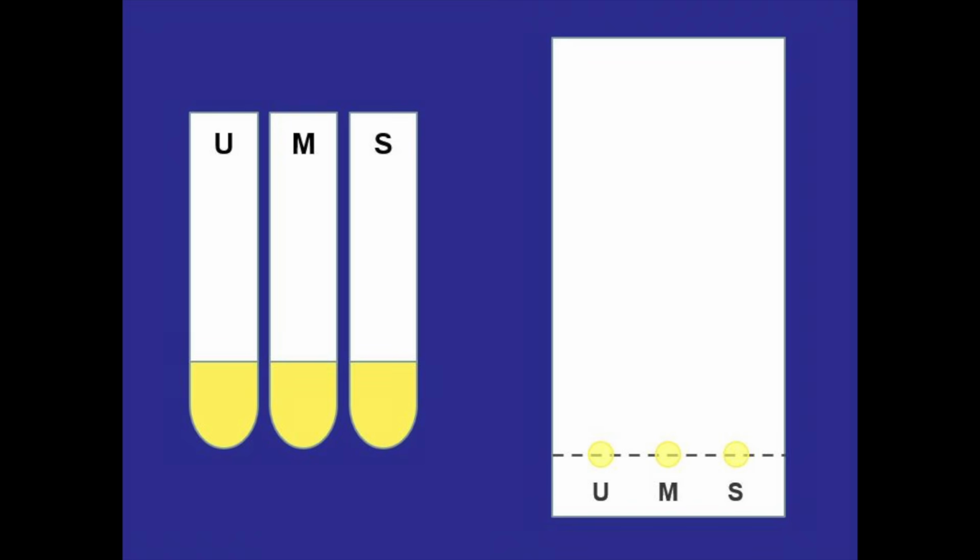Once the TLC plate is developed, we'll hopefully be able to see whether or not we were correct, and in this case, the standard derivative does not match up with the unknown derivative, and the middle spot for the mixture shows 2 different spots, meaning that they are 2 different compounds. So our initial guess of cyclopentanone was not correct.